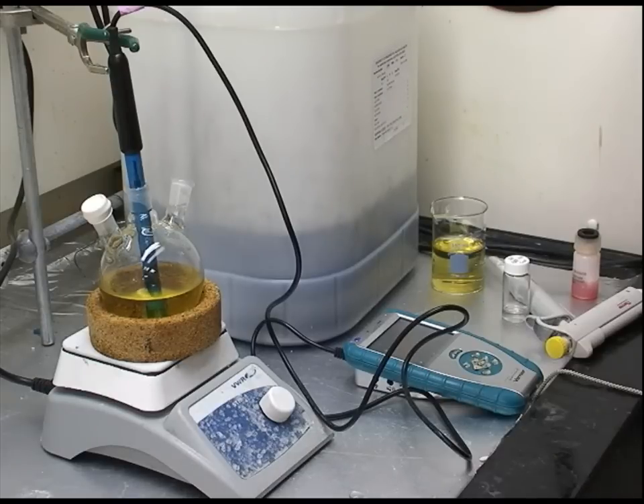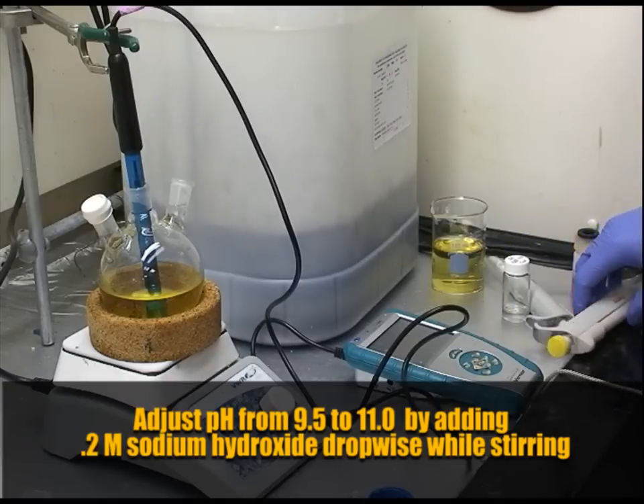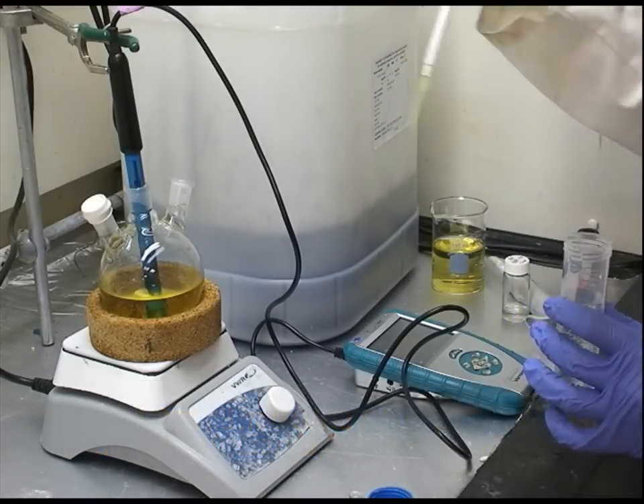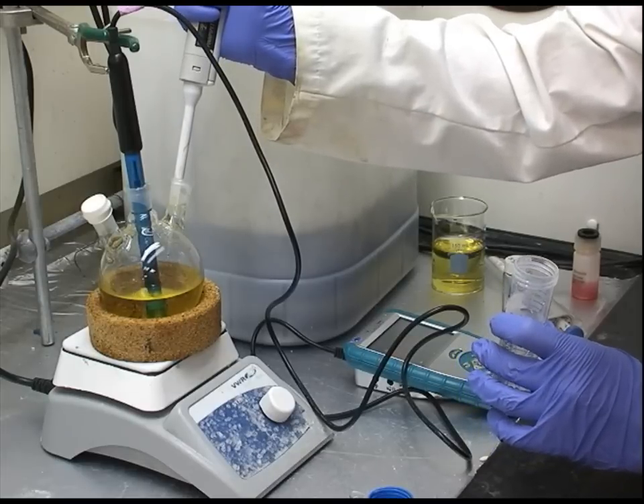After this we remove the solution from the foil and ice bath and adjust the pH. The starting pH will be around 9.5 and the ending pH should be 11.0. We use 0.2 molar sodium hydroxide added dropwise to elevate the pH to 11.0.